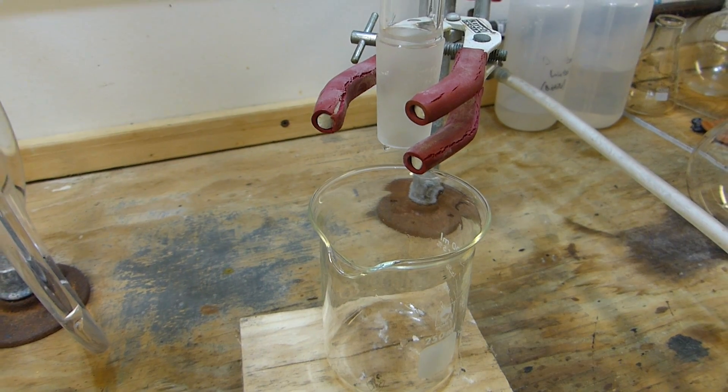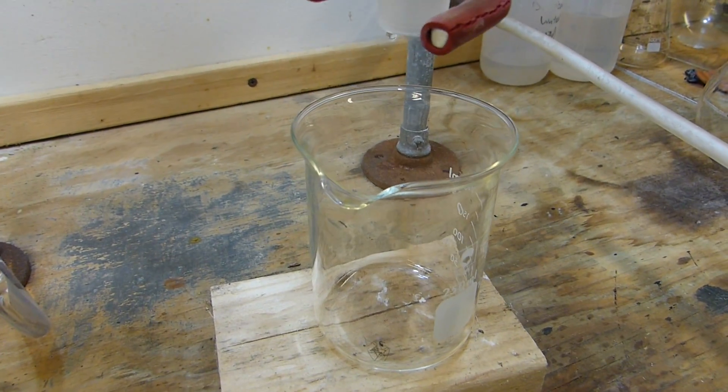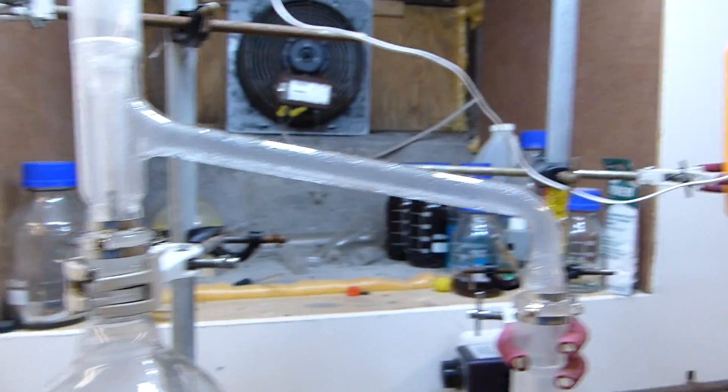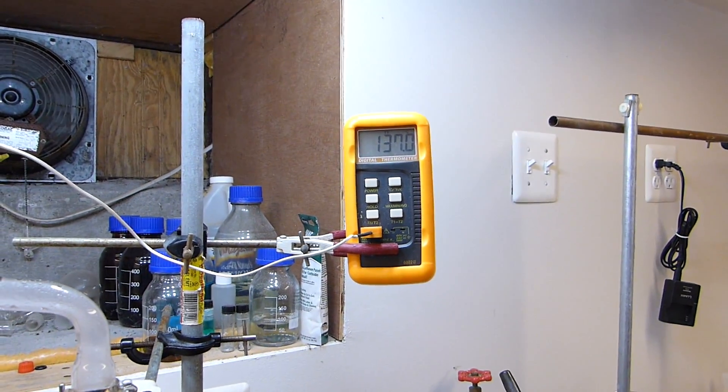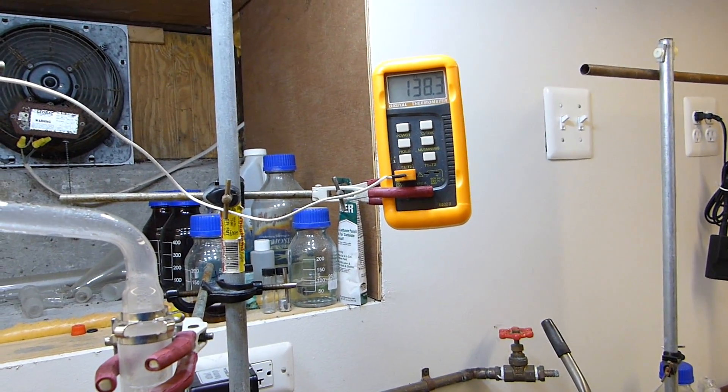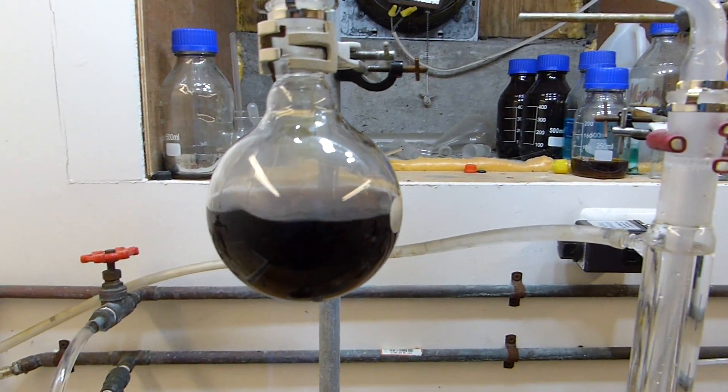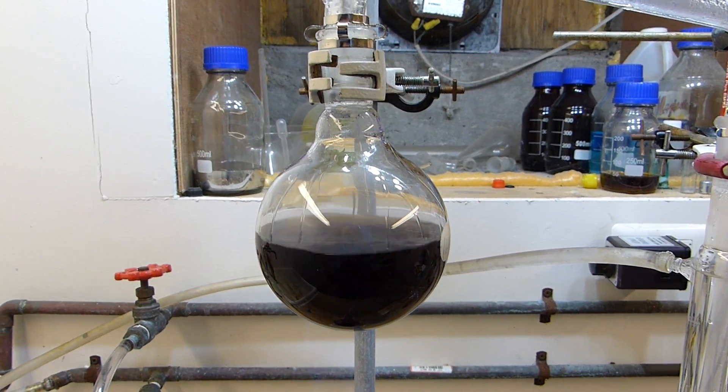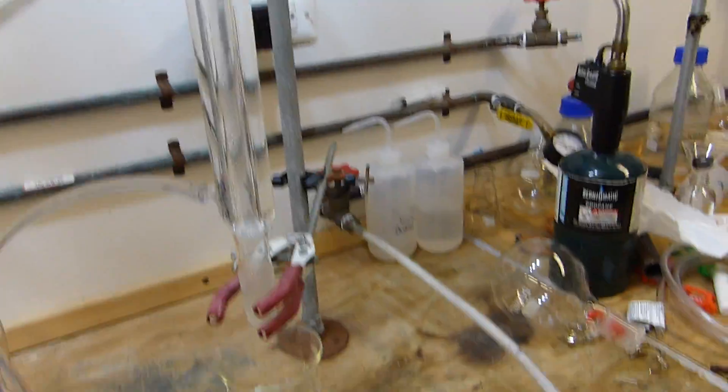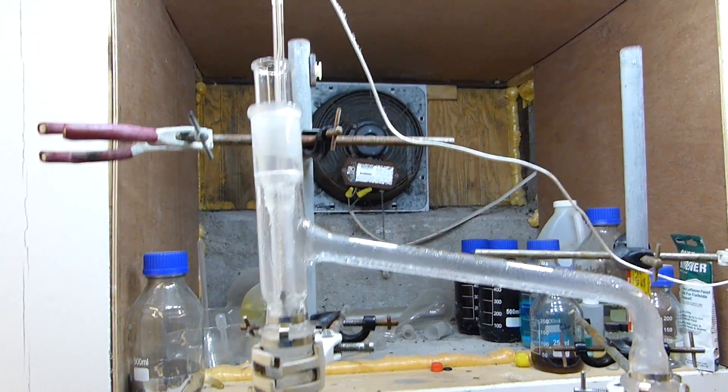All right we're getting our first collection of distillate here just a few drops at a time, basically just pulling the water off. It's pulling over at 136 C which indicates a weak sulfuric acid solution which is distilling out. And I'm just going to continue to heat this until we're distilling sulfuric acid at roughly the azeotropic temperature and then we'll switch flasks to the collection flask.